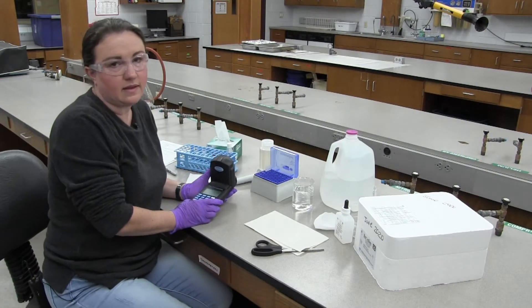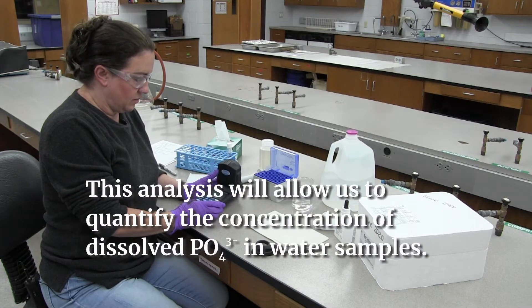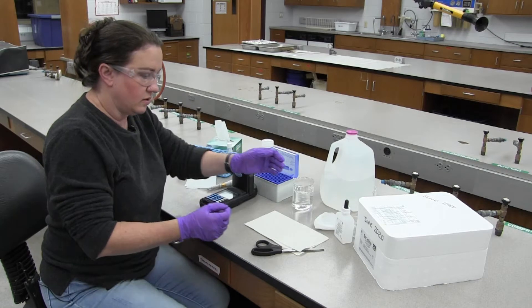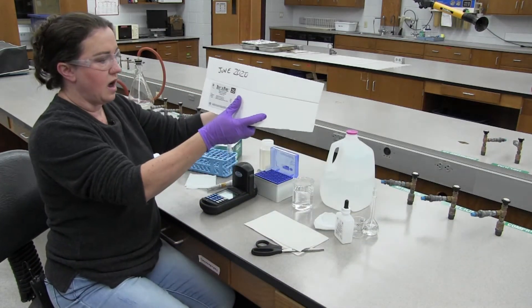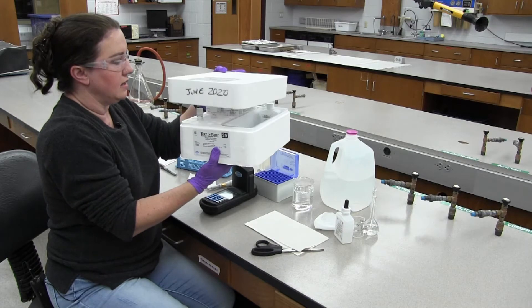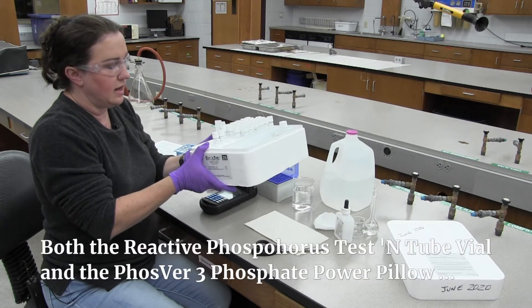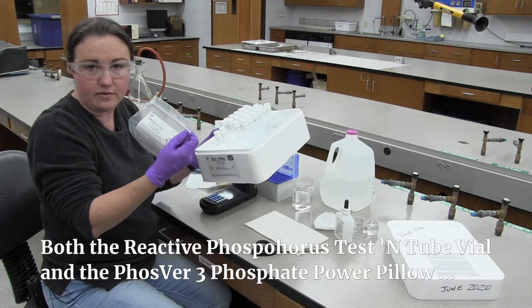Today we're going to be doing the ortho or reactive phosphorus test on a DR890 colorimeter — just a little handheld colorimeter. We're going to be using the HAWC reagent set for reactive phosphate. It comes with everything you need, including the valves for the test itself. It's a test-in-tube process and comes with reagent powder pillows — specifically PhosVer 3 phosphate reagent powder pillows.